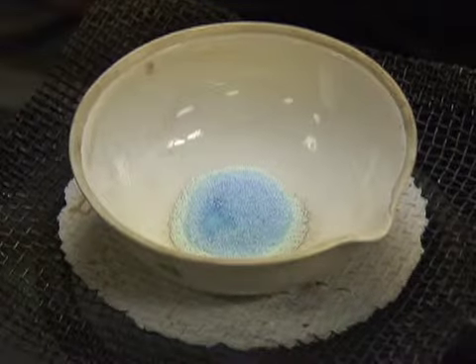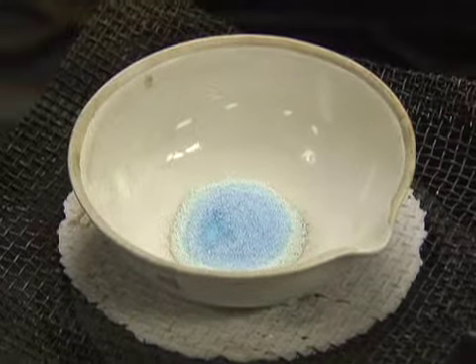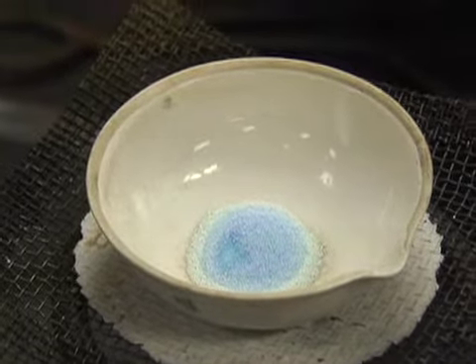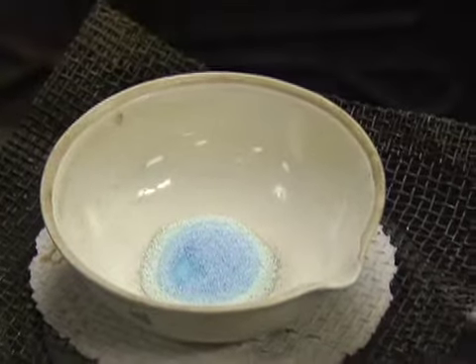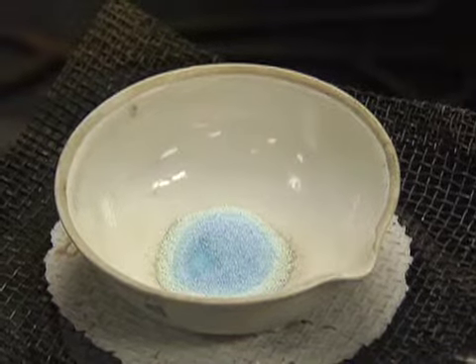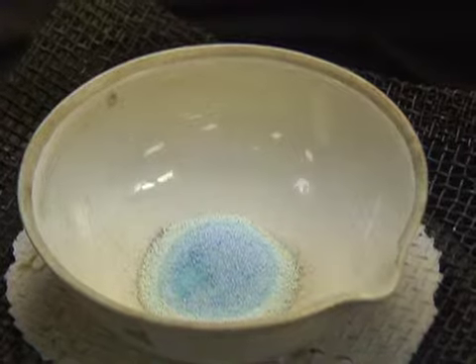And I can see how that crystal, the water is going away. It almost looks like an island in the middle of the ocean. It's very, very interesting. And it's almost like there's a little puddle of water. That's amazing. And I'm timing it, and we're supposed to allow for approximately 10 minutes for this crystal. However, the time just gives us an idea of approximately what we can expect. And in actuality, I can observe when it seems that the water is gone.